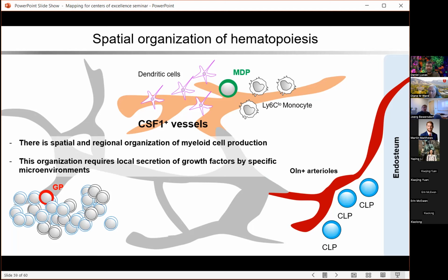Yes, only that is much slower. So for software, we usually use Imaris for annotating the cells and placing the dots, and then those coordinates get exported to MATLAB. You can do this in ImageJ if you need to, right? Any regular image analysis software will work. And most confocal cores have this software. Yeah. Okay, thank you so much.